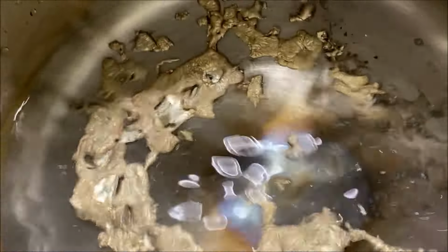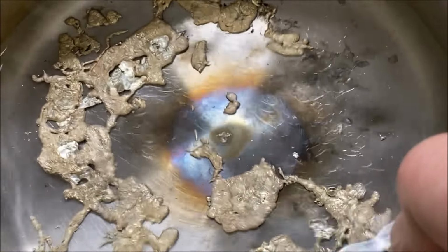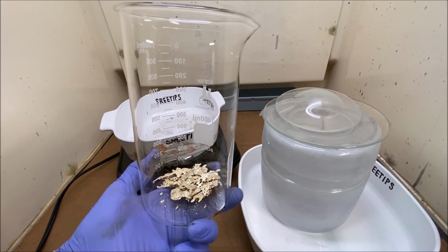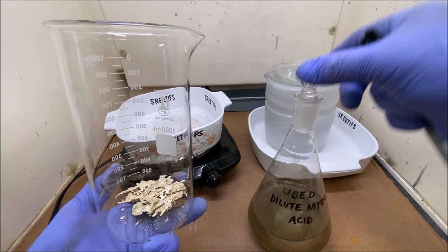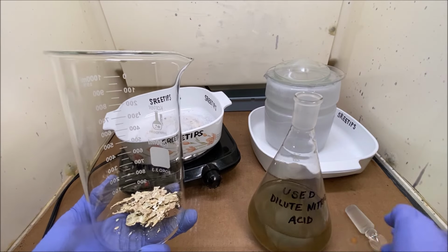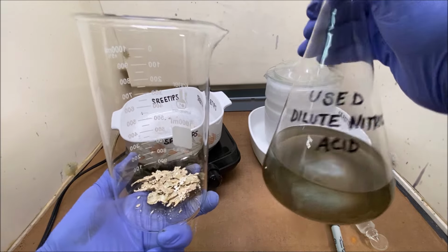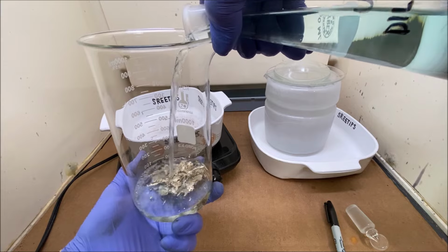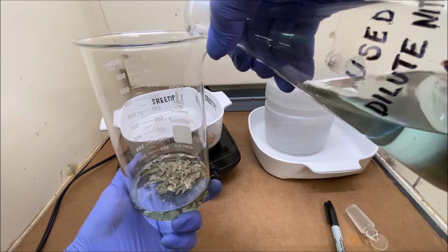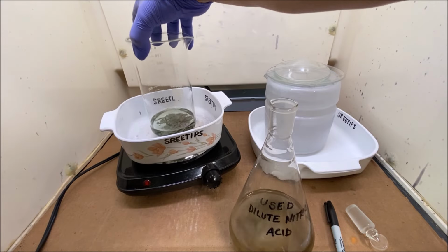Get this out of this container into a beaker. Start pulling the silver and the base metals out with nitric acid now. Here's the inquarted gold. What we're going to do now, got some used nitric acid from a previous refining. I'm going to add a little bit of this to our inquarted gold. We're going to start pulling the silver and the base metals out of here with this used dilute nitric acid.